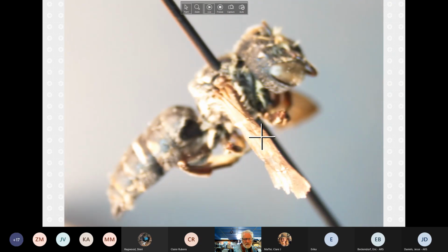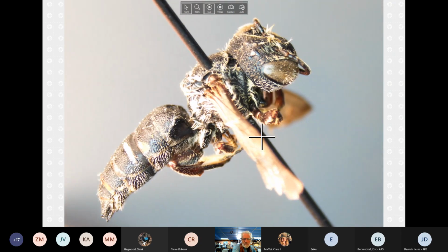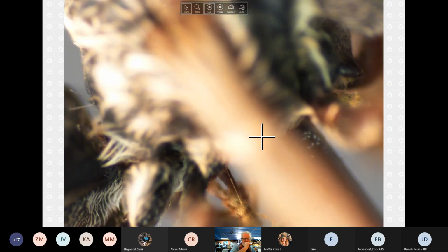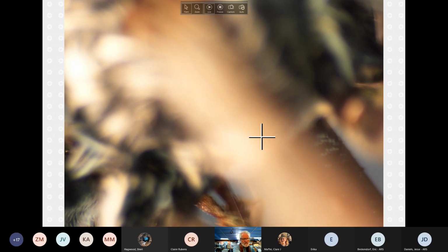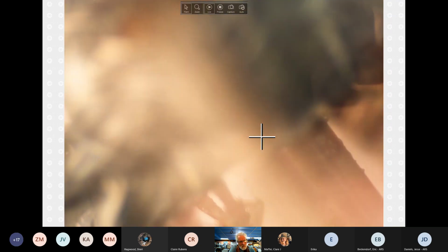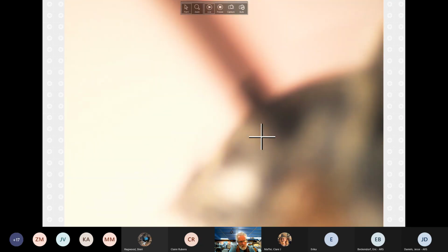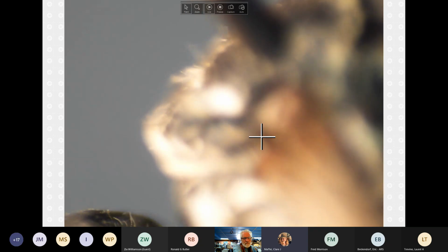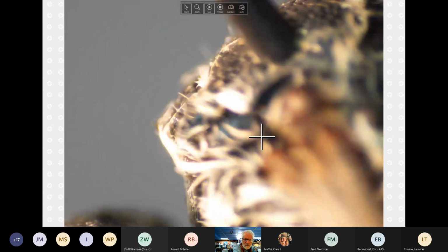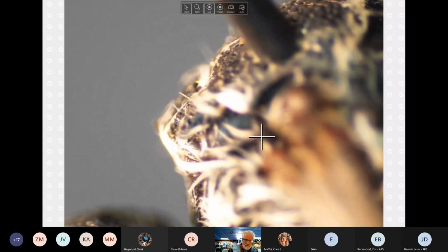I somehow feel like it's refreshing at some odd rate. Okay, I've increased the power. And if it's any relief, Sam, you only got about 10 more minutes. Okay. All right, well, we'll do hunteri, and then we'll have done a good introduction.